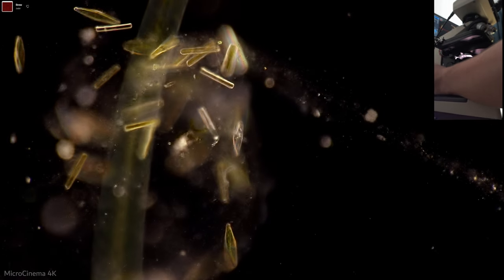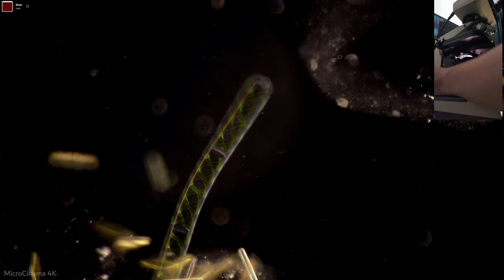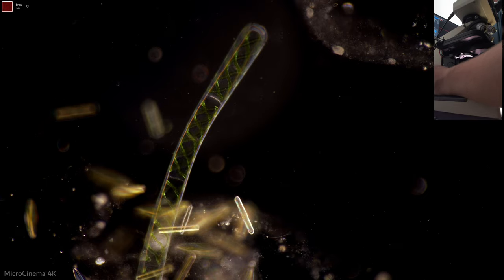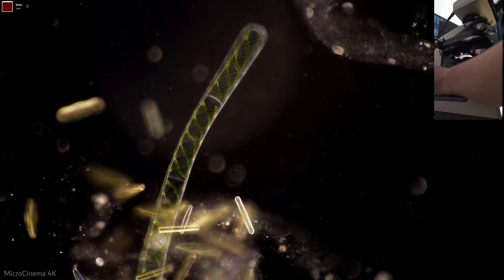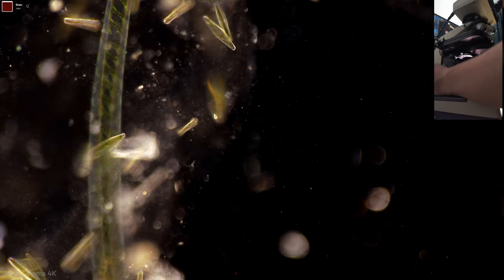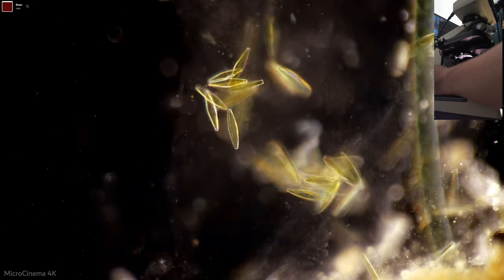But if we go to the 10X lens, this is my 10X S plan Apo lens, then we get a real nice dark field. And there's no vignetting or anything like that. It's just good old dark field.